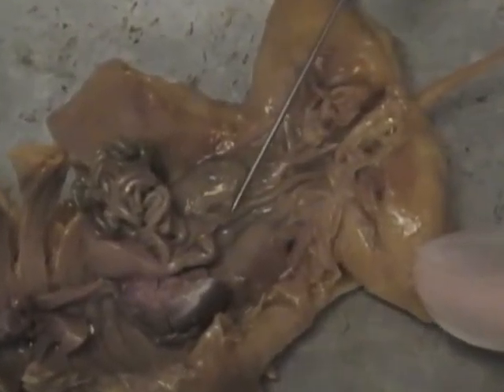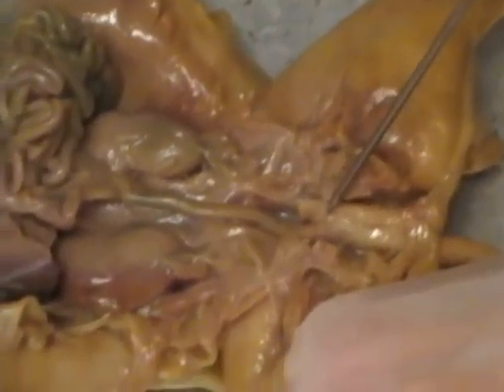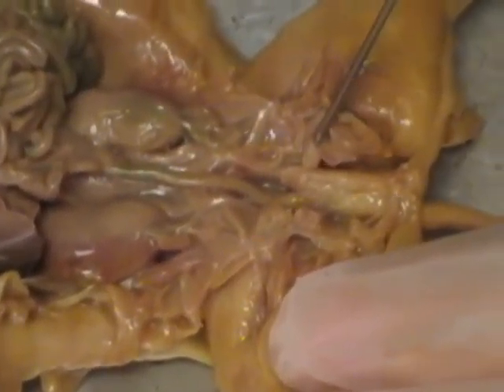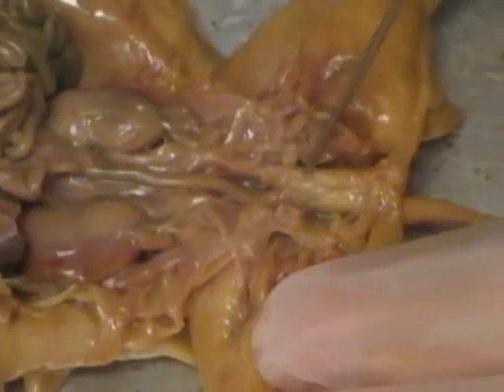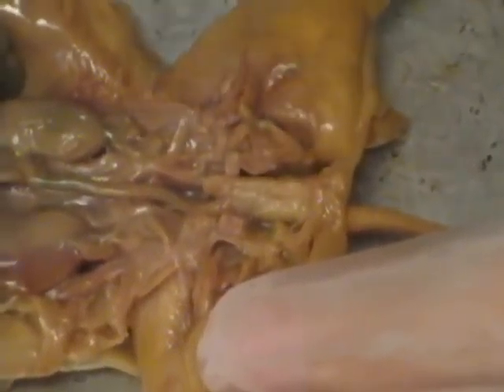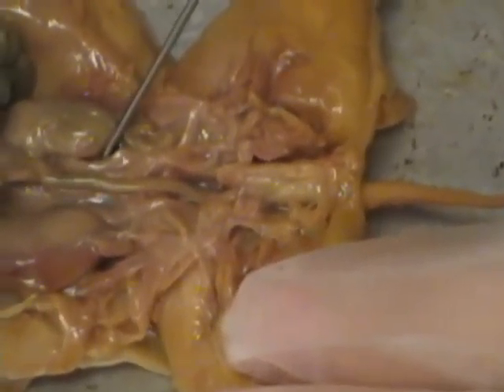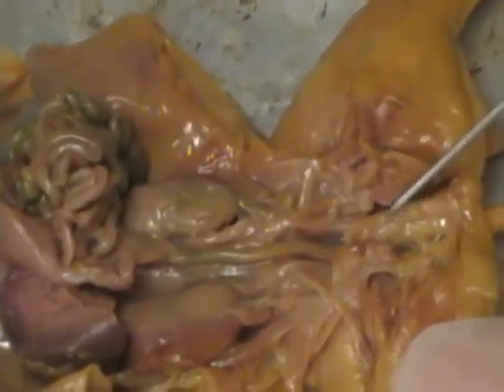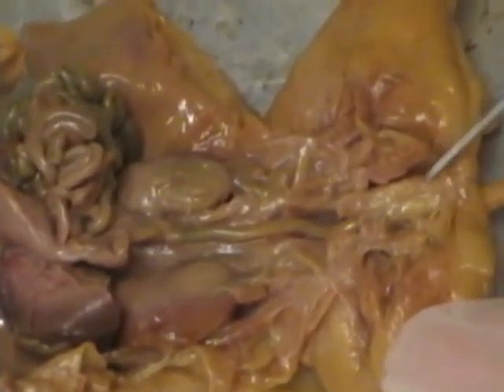Okay, so right here is the end of the large intestine. It's right here to the rectum. You can see here, it's two different segments. This leads and goes to the rectum, and this thing is part of the female, I forget what it's called. Urethra, that's what it is. This is the urethra.